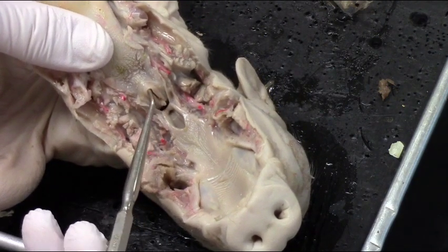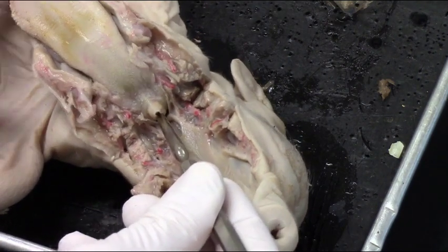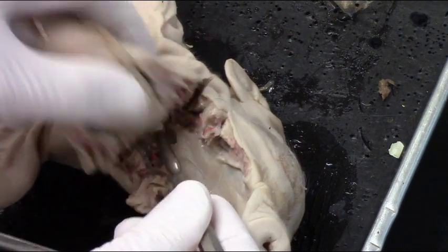The epiglottis, that little flap, is just on top of the glottis. That's the hole that my probe is in. The glottis leads to the trachea and the chest cavity.